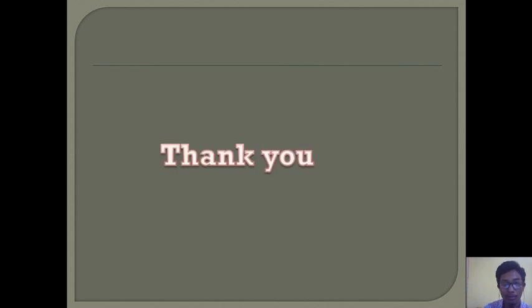So that's all for the practical of study of gram staining.